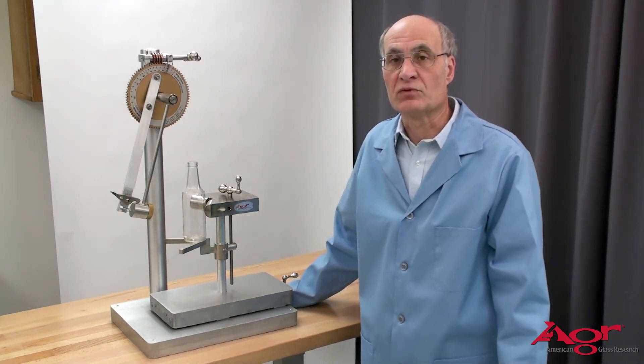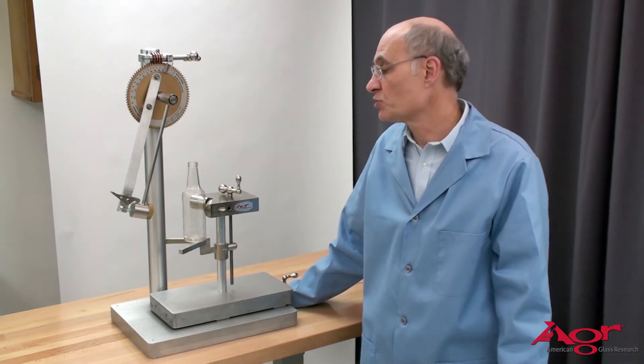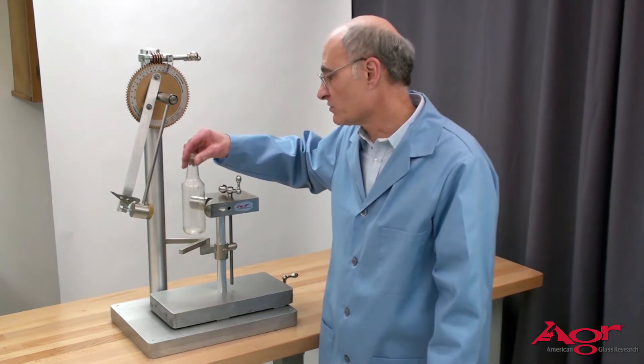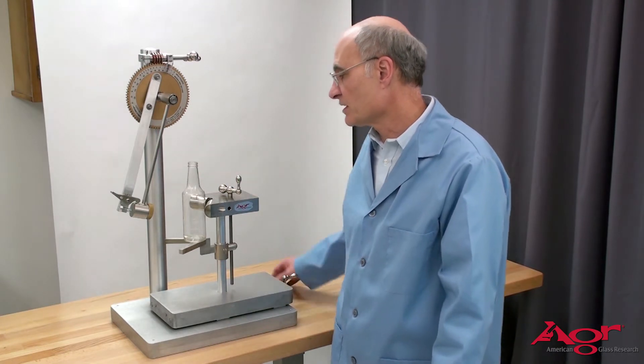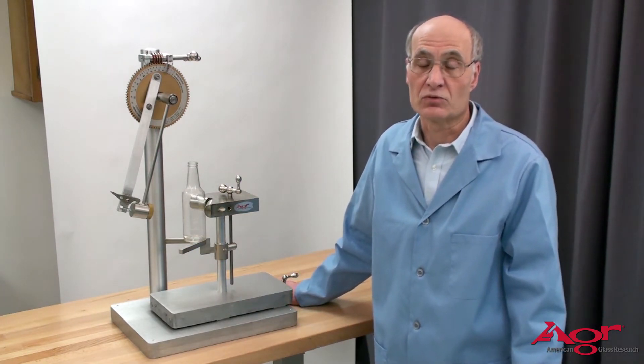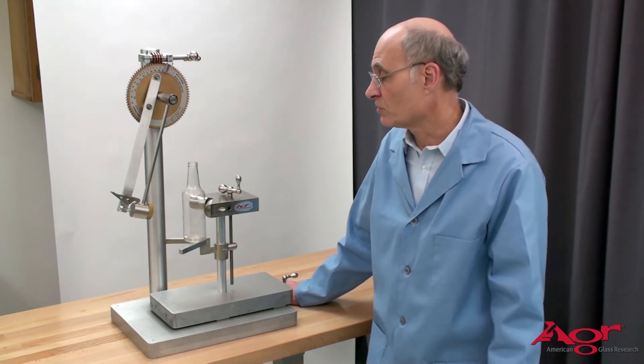There are several different ways of doing impact testing. Most commonly when we do testing at AGR we tape the bottle first in order to keep the pieces together to allow for fracture analysis. The nice thing about that is that you do not have to worry about losing the origin in most cases and you can look at it to see the specific type of defect that caused it to fail.